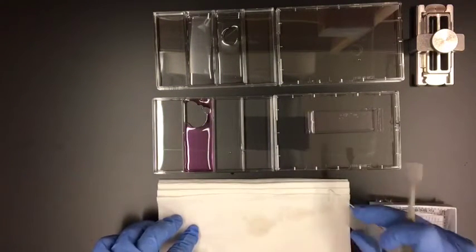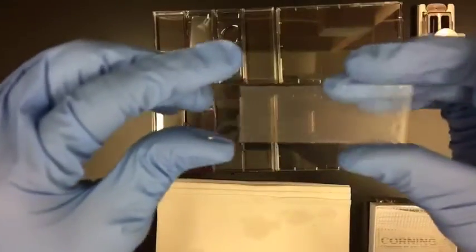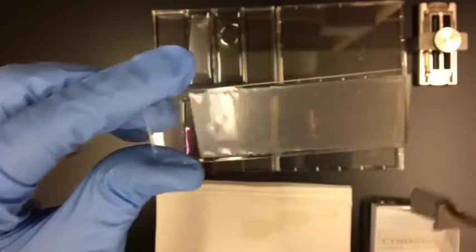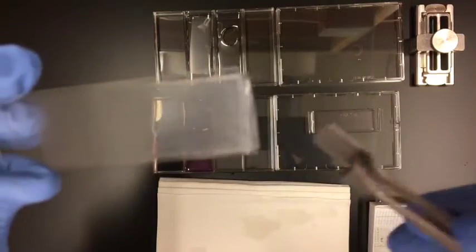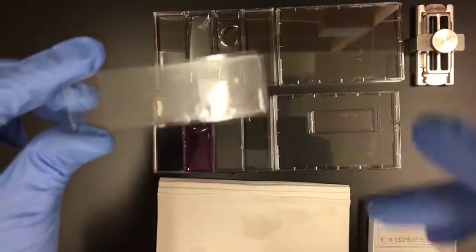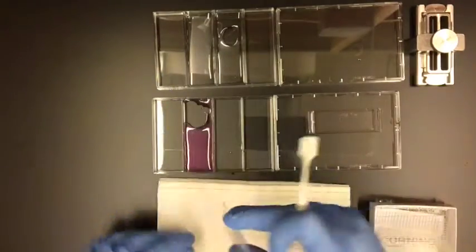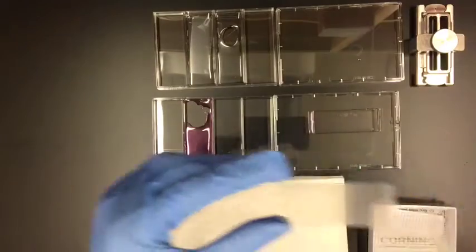Right now you can see I'm trying to dab away some of the moisture. I want it centered on the slide and I want a little bit of an overhang — just a little bit of an overhang — so that you can then sort of pinch that down against the surface of your membrane.